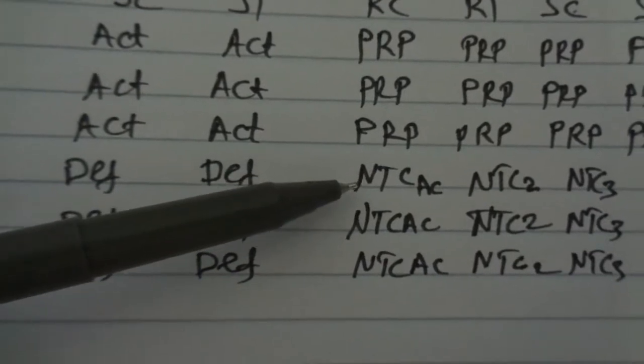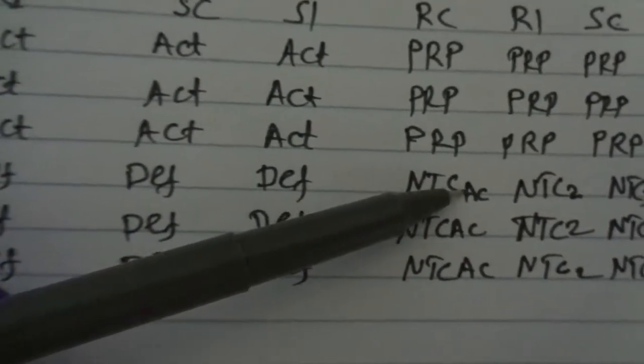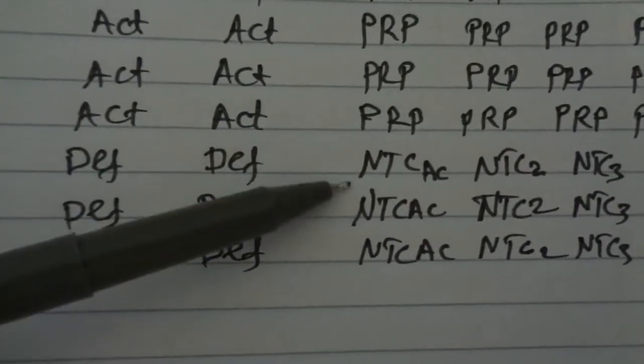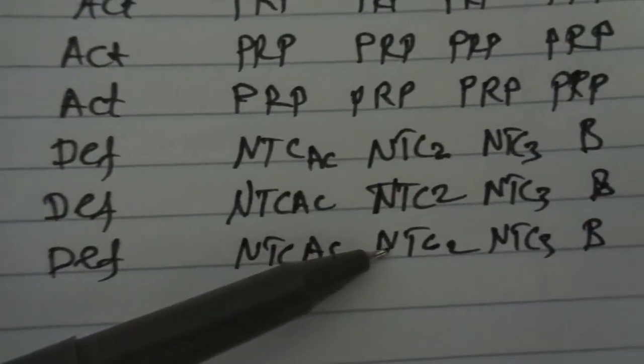Then I should use no template control. No template control for actin primers is also replicated 3 times. And no template control for defensin gene primers, replicated 3 times.